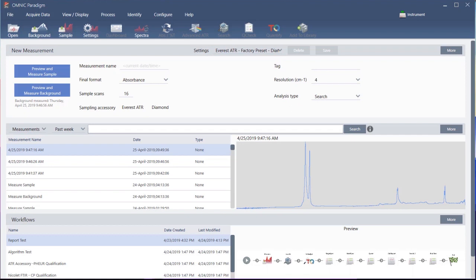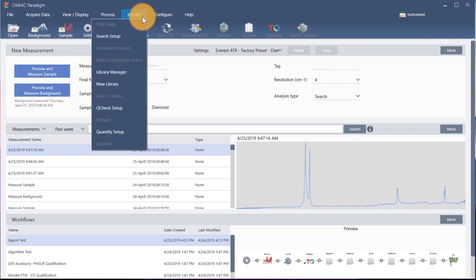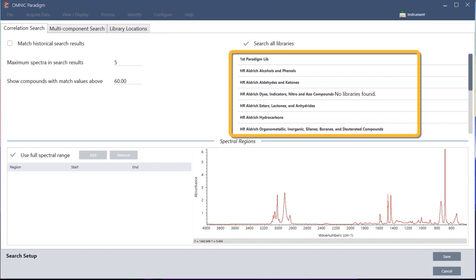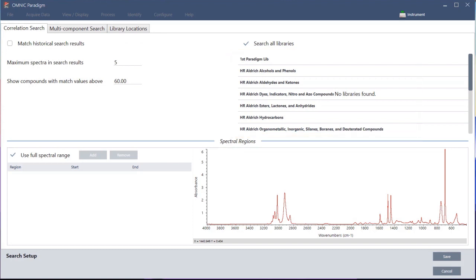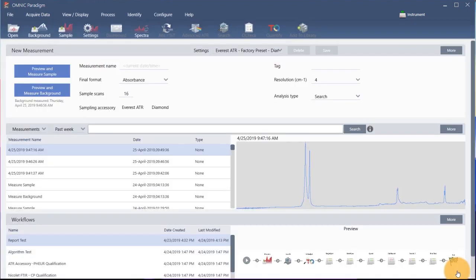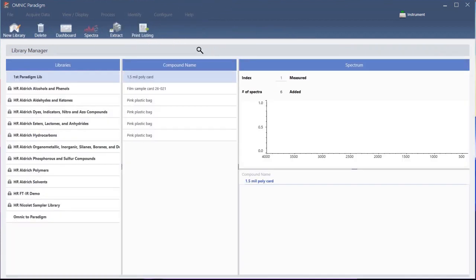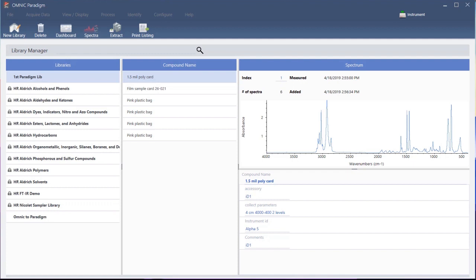All existing spectral libraries are selected automatically by default. Use Search Setup in the Identify menu to view or change your library selections. For this demonstration, we are using the free libraries provided with Omnic Paradigm software. Choose Cancel to close the Search Setup window. You can also use the Library Manager in the same menu to easily create a spectral library. Any libraries you create should be from pure materials that represent what you expect to find in your unknown samples.